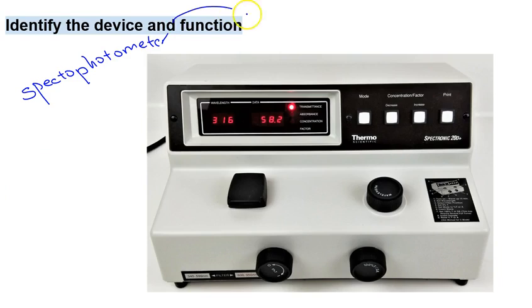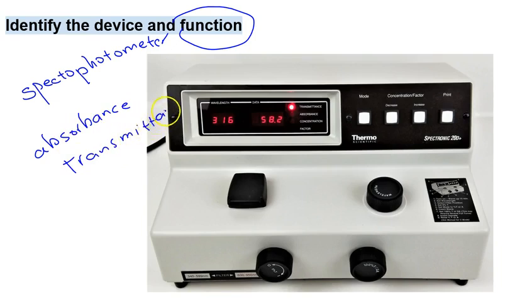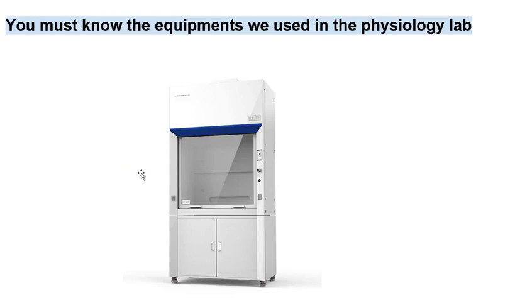So you have to know the function of this device for measuring the absorbance and also the transmittance of a solution. Next in view, we have the fume hood.